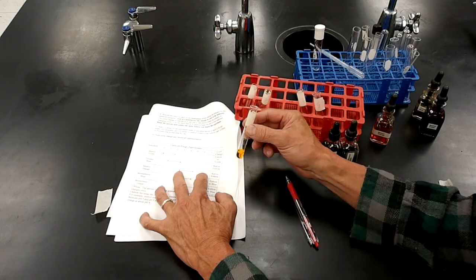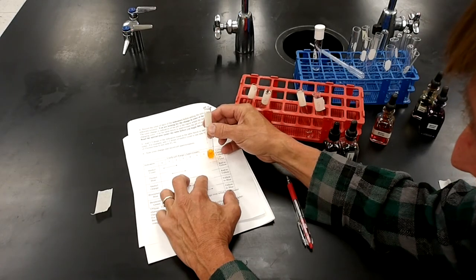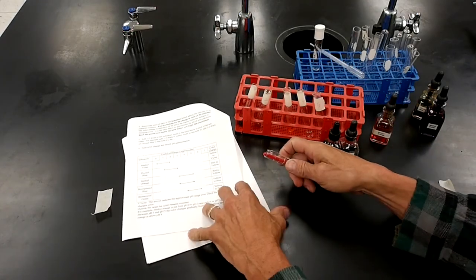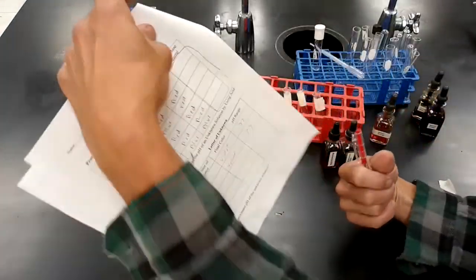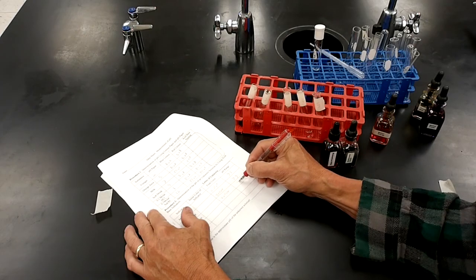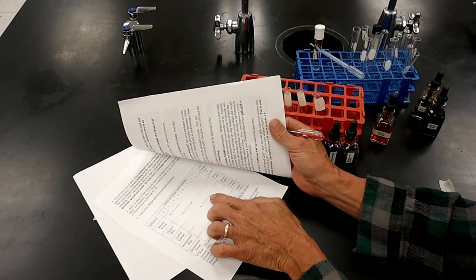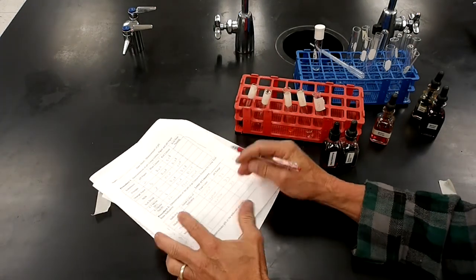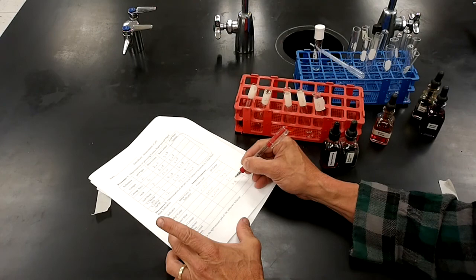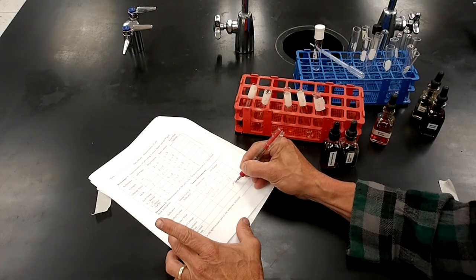And 5 and 6, it's going to be yellow. I'm going to call that about yellow for the moment. That would make it greater than 5. Oops. Greater than 5. Went to the wrong line there.